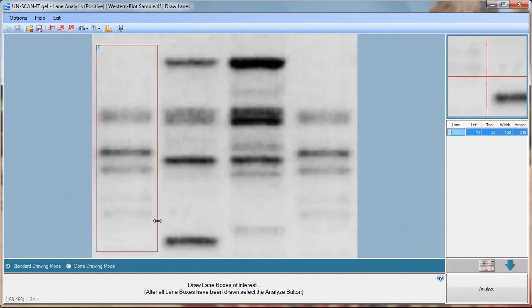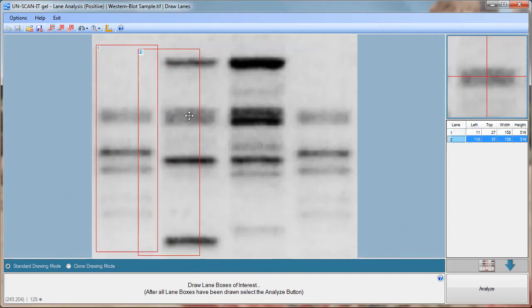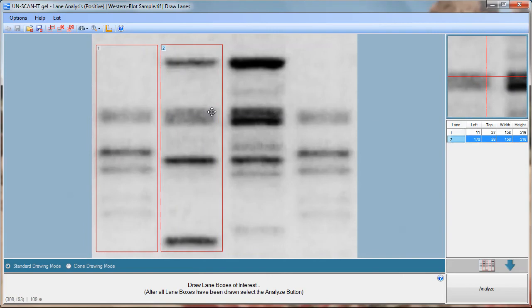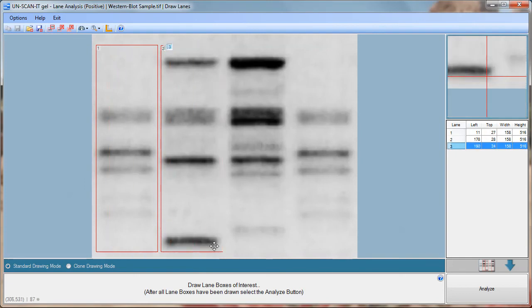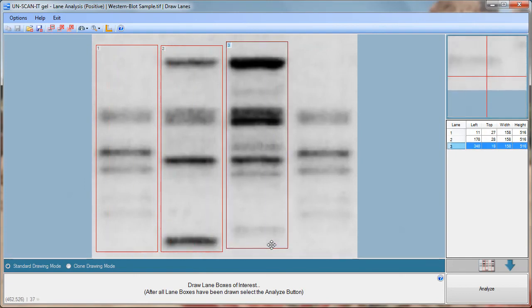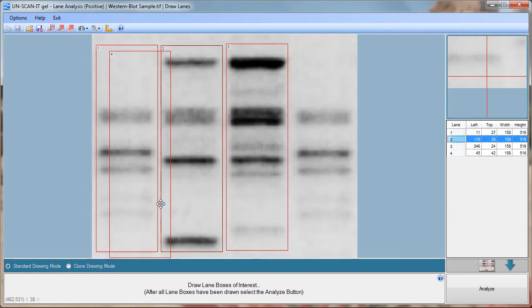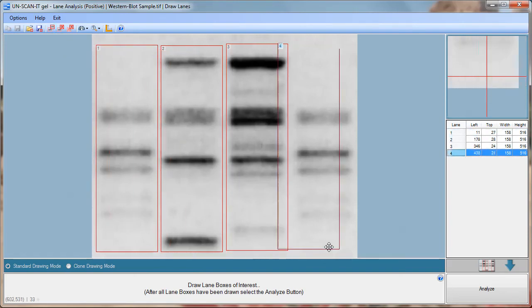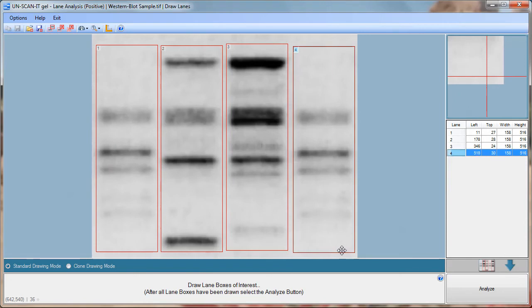You can draw the lanes individually or use the copy button on the toolbar. The boxes can be resized or moved by hovering the mouse over the box and dragging the box.